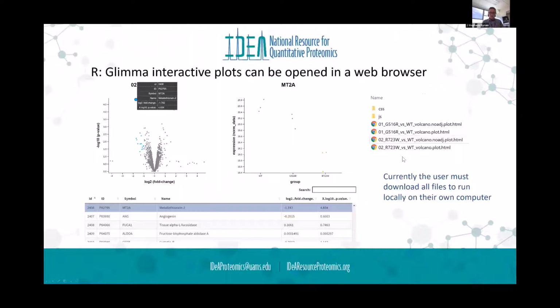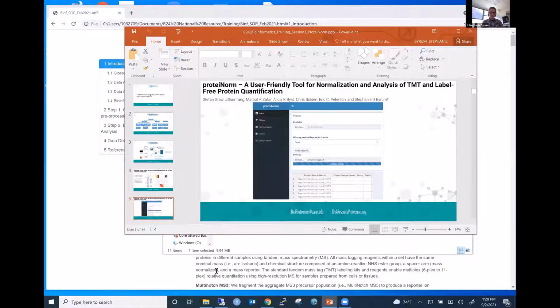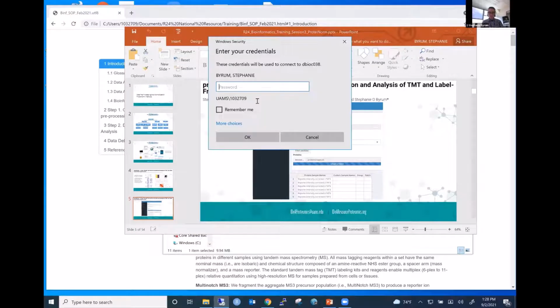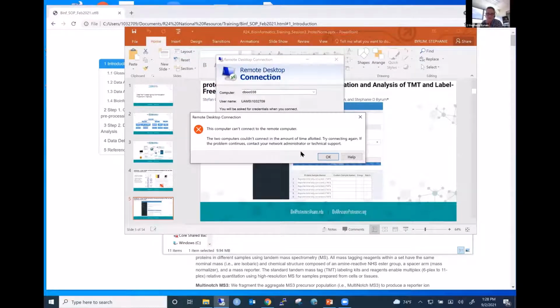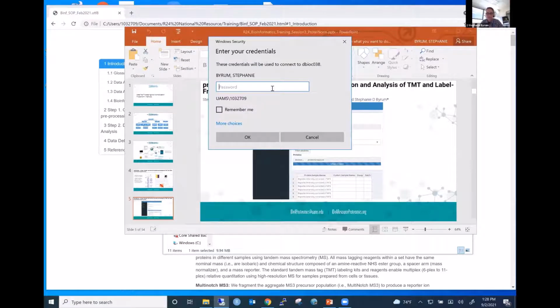I think what I'm going to do now is see if I can switch to my other computer and show you what it looks like. If I do it on this computer, it will crash my Zoom. So I tend to have to remote in. Well, come on. Let's see if it'll work here. I was having this issue earlier. I may have to do it later. Let's find out.